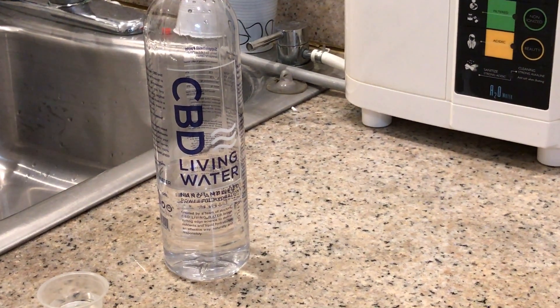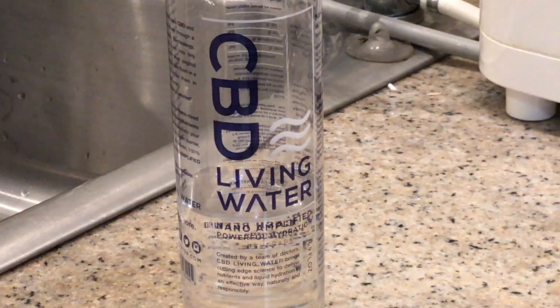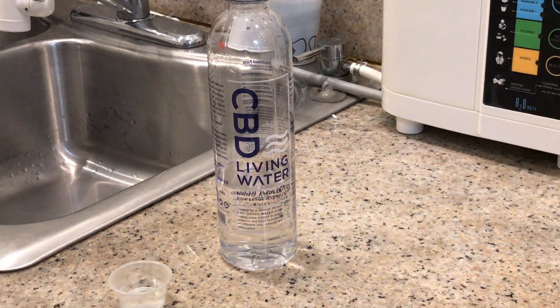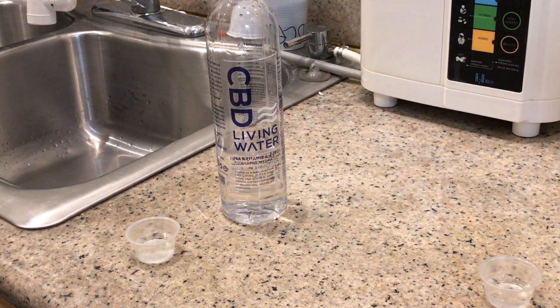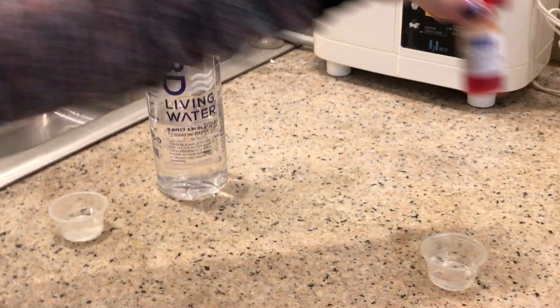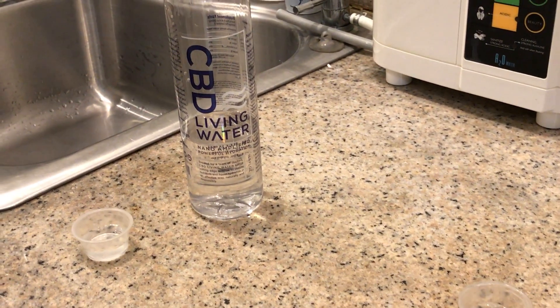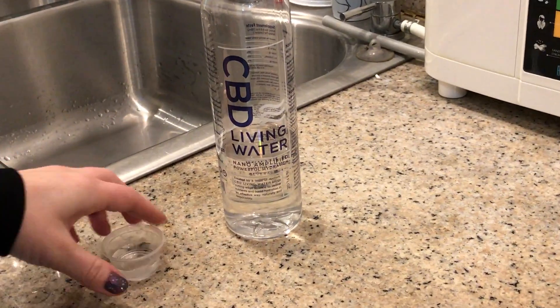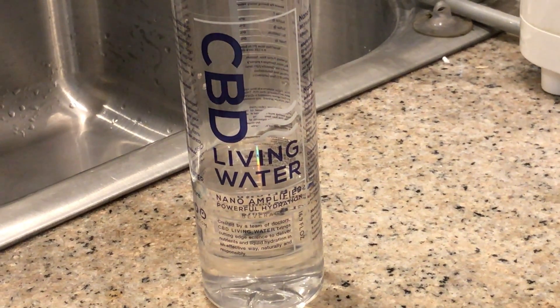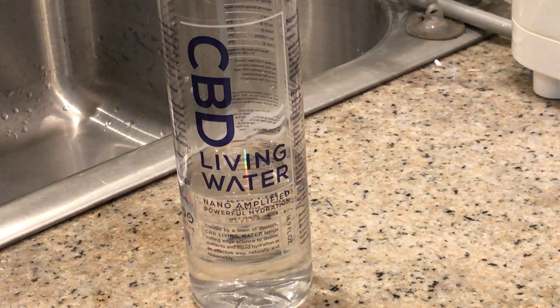Right now we have CBD water and we're going to go ahead and test its pH. CBD is the oil that's in the marijuana plant, but it's just the part of the plant that people use for medicinal purposes to relieve pain. It does not get you high.